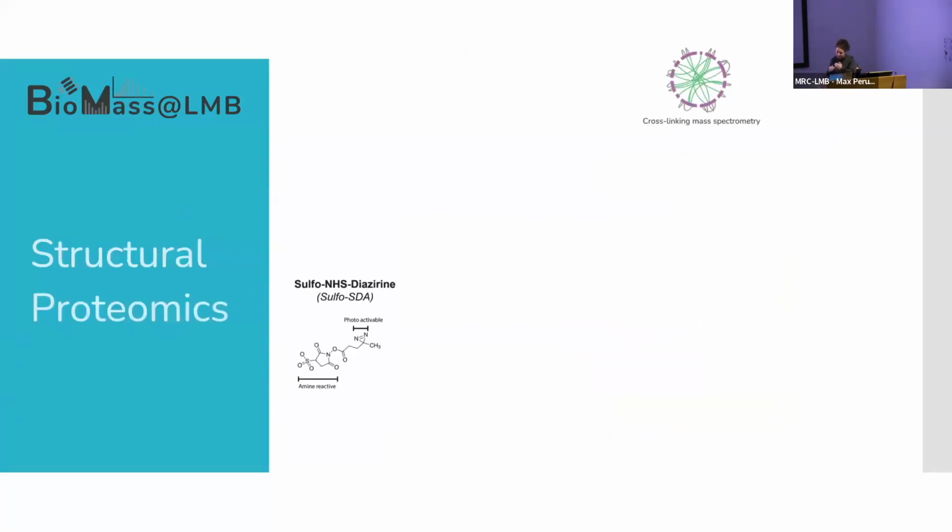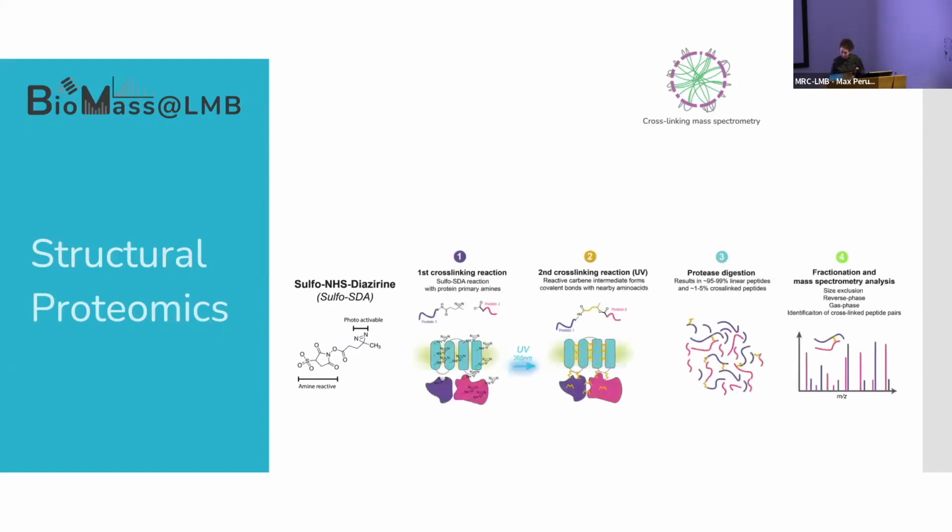Now, I'm going to slightly change the topic. So this was a brief overview of the quantitative proteomics workflows that we have in the facility. Again, we also do these different things, and this is structural, going into the structural proteomics field. The only difference from what I've just explained is that we actually work with complexes or proteins that are in their native states.